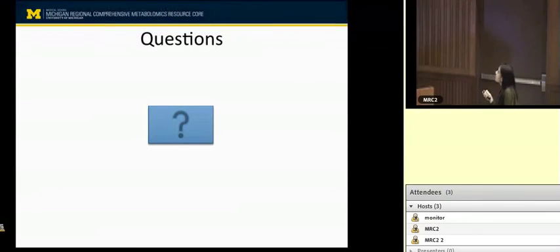So we don't see much difference in the LCR, HCR young animals and old animals, but we do see the LCR mature animals cluster mostly in this cluster, which is, sorry, the old animals. So these LCRs cluster more closely to these old animals, and the HCR mature animals cluster separately. So this is just an example of a different way of visualizing the data. If there is an interesting pattern or visualization, we do give this with the report.